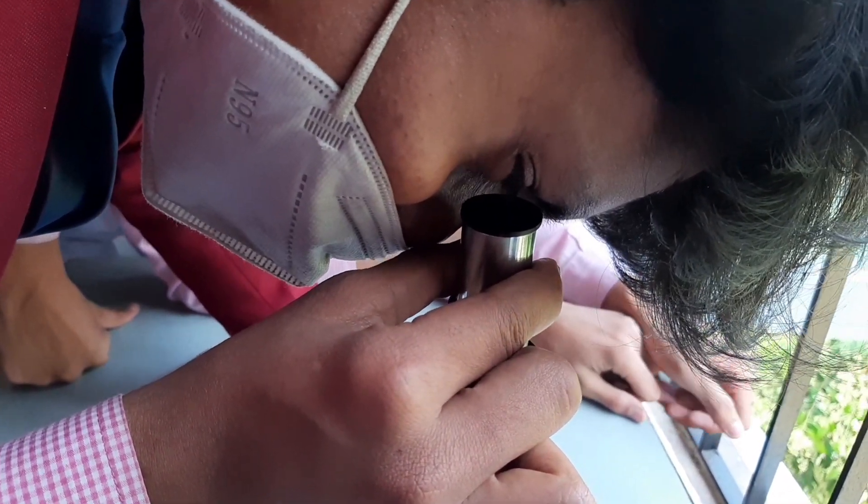In parenchyma tissue, you will see that the cells are isodiametric, which means the cells have equal length and width, and the cells are loosely packed.